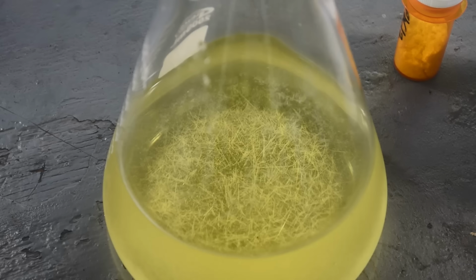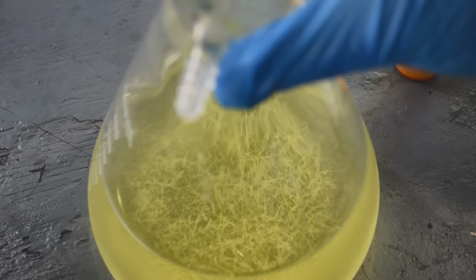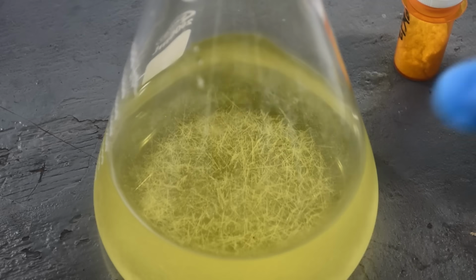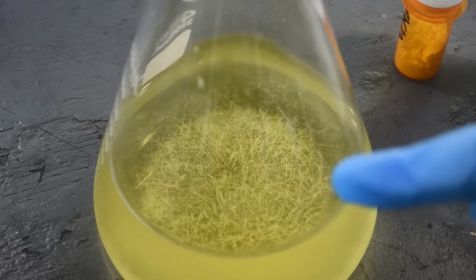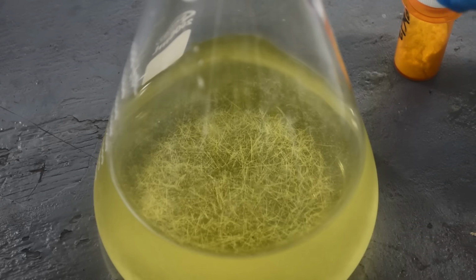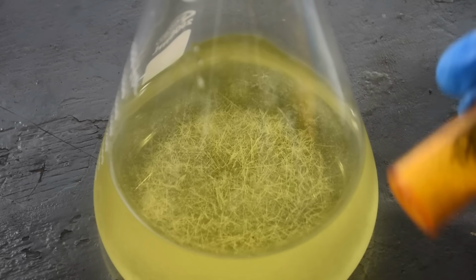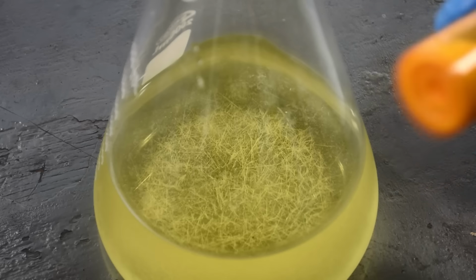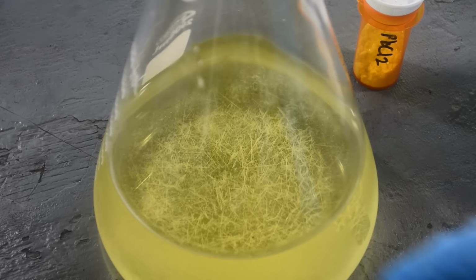Well, it's the next morning, and just as I suspected, as this stuff cooled down, it's like the mid-50s Fahrenheit out here. Look at all the crystals that formed. I was really having a hard time believing that all this is lead chloride that's made it this far through the process. But then I got to looking at a sample of lead chloride that I actually made quite a while back. I didn't think that it was long needle-like crystals, but I'm looking at these crystals. There are a lot of long needle-like crystals in there, so this actually could be lead chloride. But like I said, I'm having a hard time believing we got this much lead from the little bit of solder on the legs of those chips that might have come through.